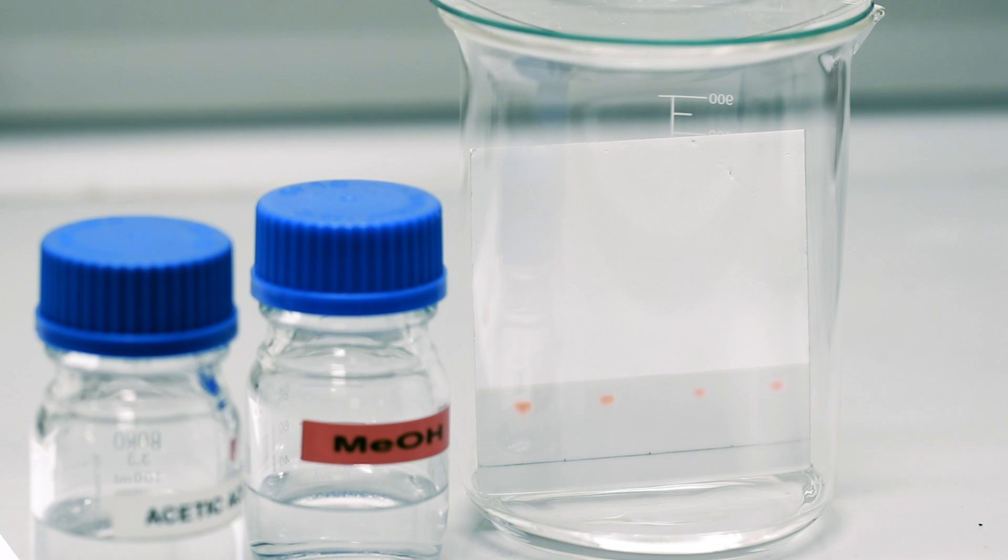Thin layer chromatography, TLC, is a simple but powerful method that enables us to physically separate the chemicals in a solution.